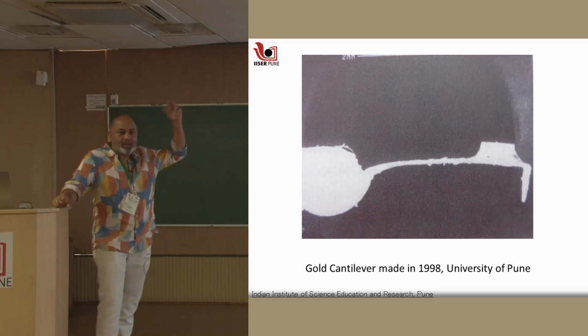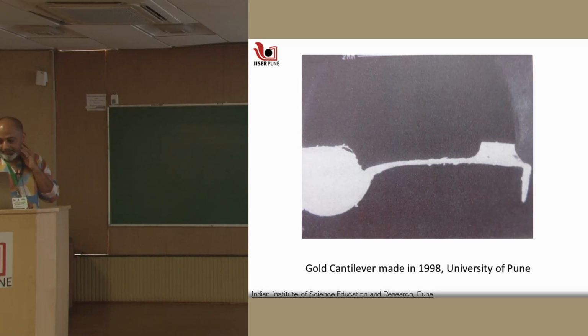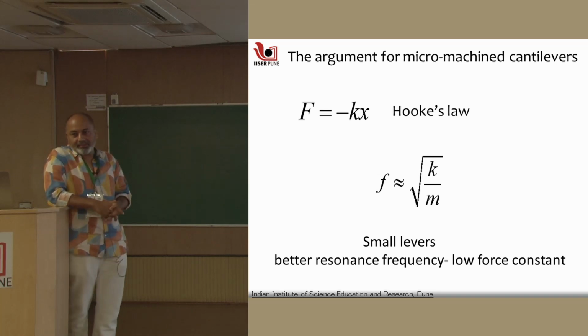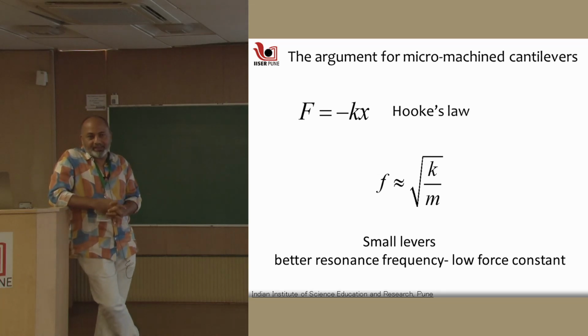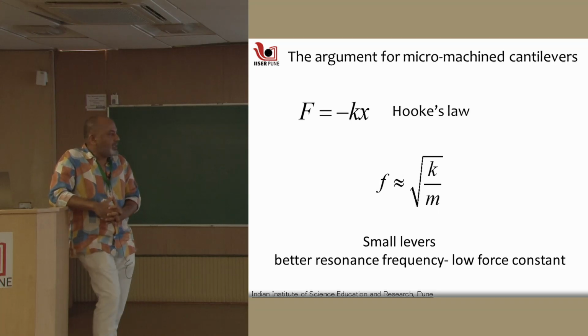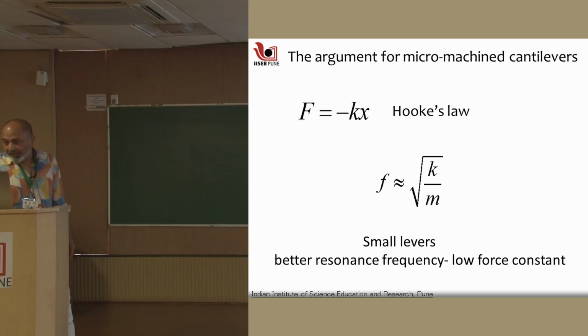And shine a laser on the back and everything, which was done in 1998 from Pune University. Okay, but now this is the real thing. This kind of cantilevers are not really great. They can do some force measurement, but not great for imaging and for various other things. Okay, and this is where we start our real AFM business.